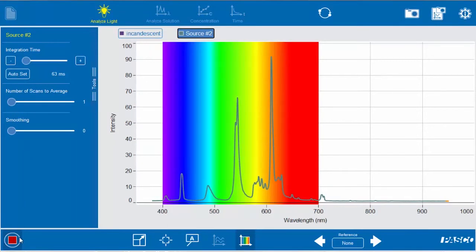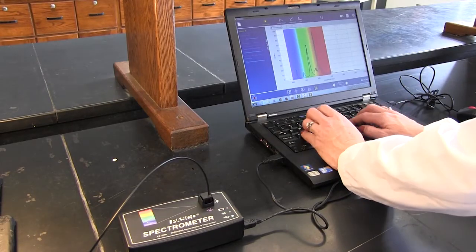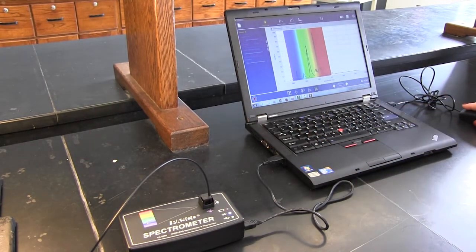Once you're happy with it, you press stop. And again so we can identify, we will overwrite and we'll just put in CFL for compact fluorescent light bulb.